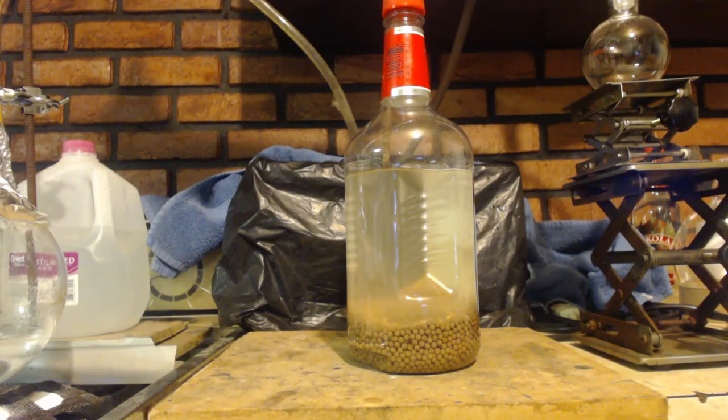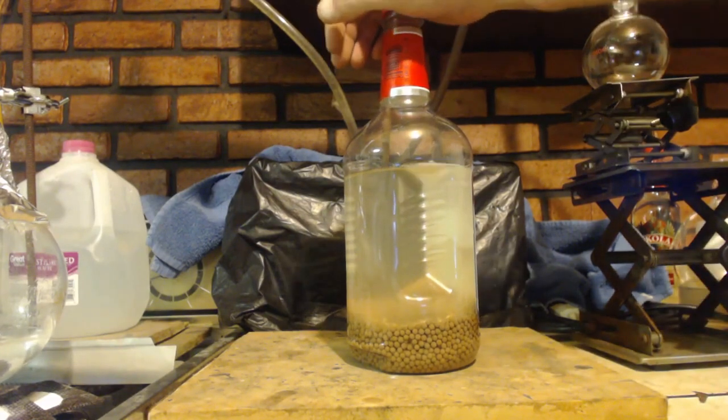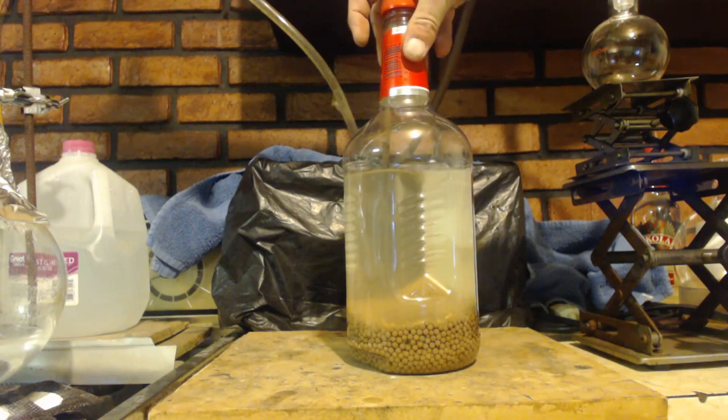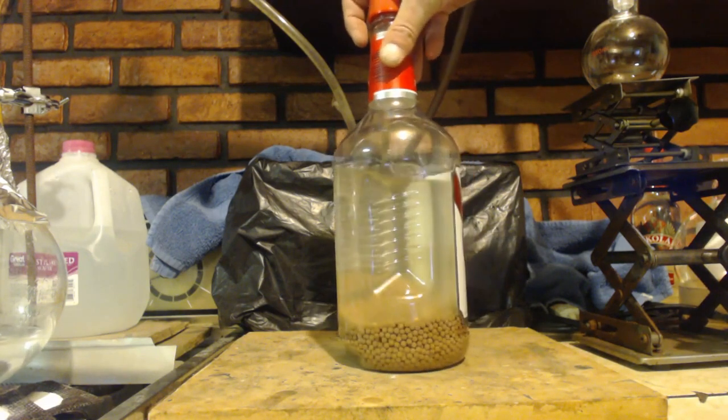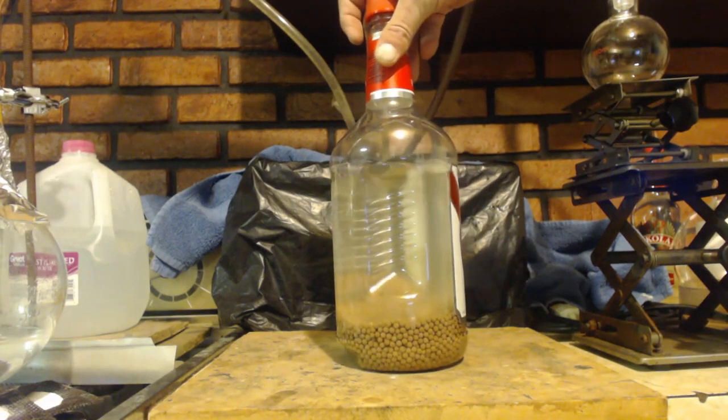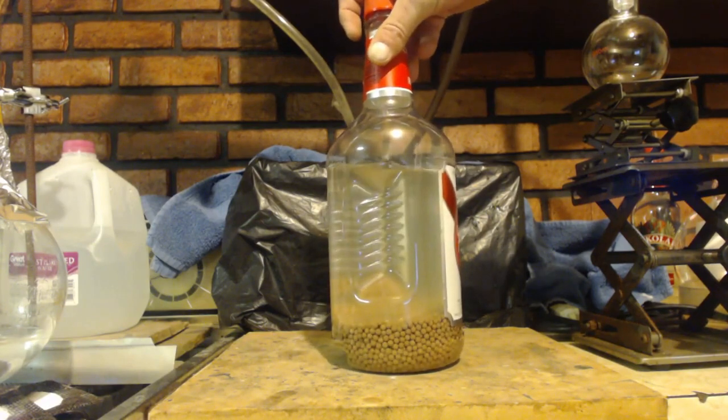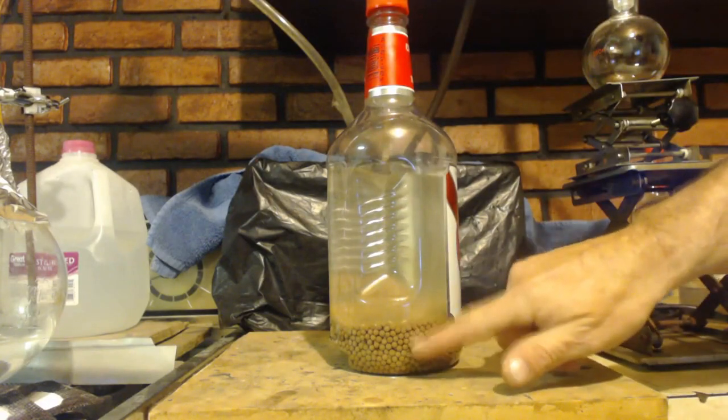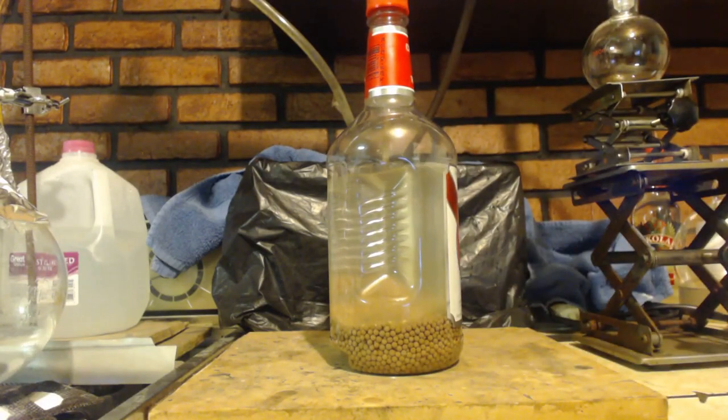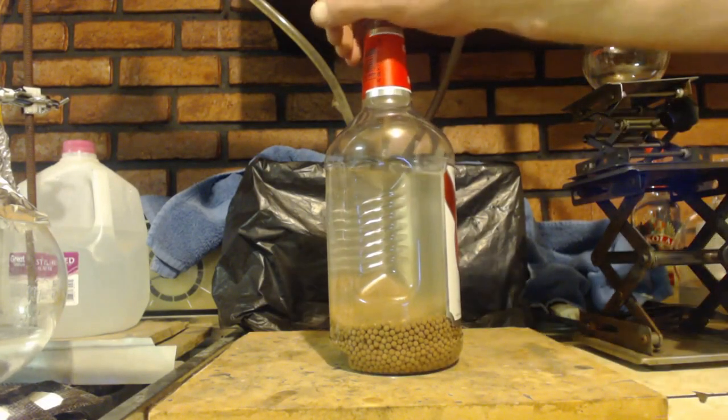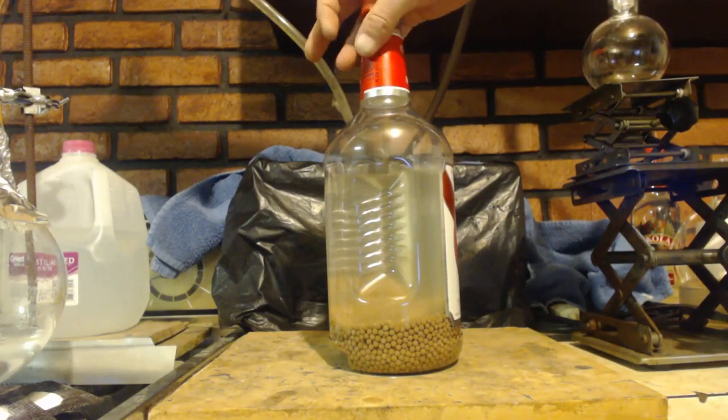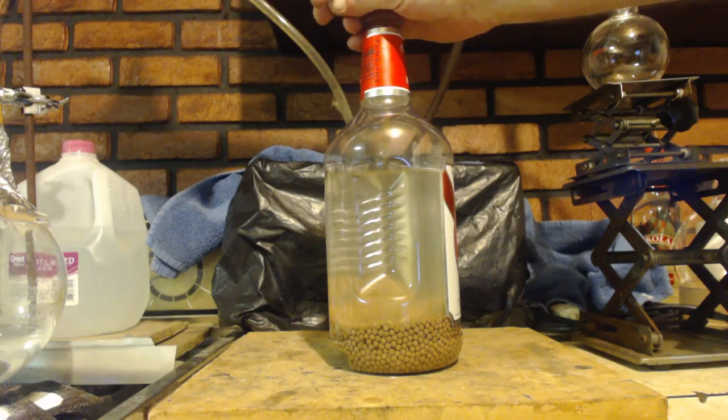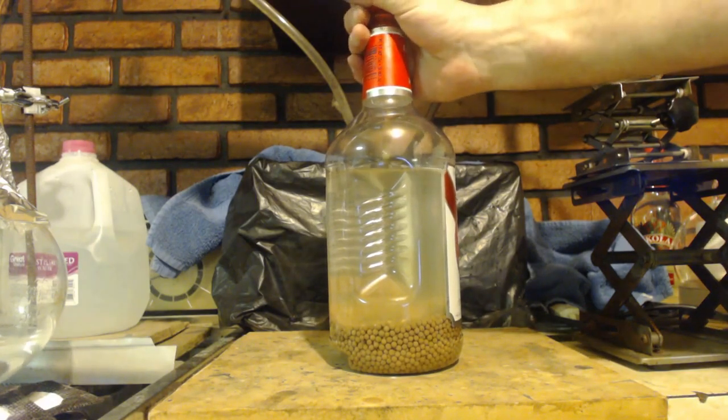So two videos ago, I did anhydrous ethanol, how to make vodka anhydrous. And it didn't work. Alright. I mean, don't get me wrong, if you follow the video, that's exactly how you do it. The only problem was is after three days of storing the alcohol with molecular sieves, I had the same density, which means I have the same. It didn't soak up any water. The reason why is because those were old sieves. They were sitting in a bag for two years.